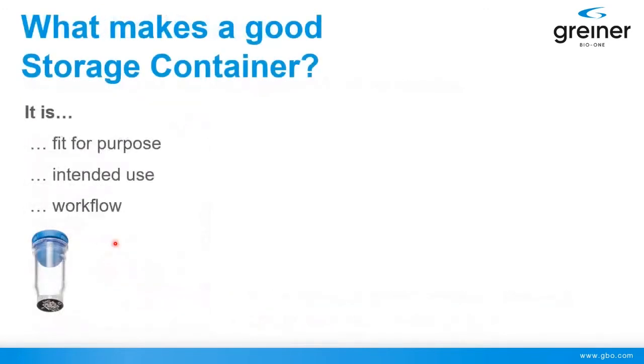So I want to conclude with the open question: what makes a good storage container? Remembering everything I tried to emphasize in my presentation today, I suggest it's not a very definite and clear answer. It must be just fit for purpose, for intended use, and for workflow.